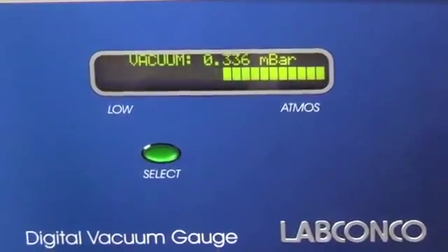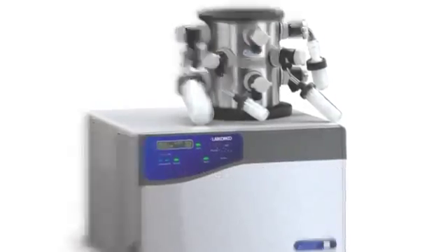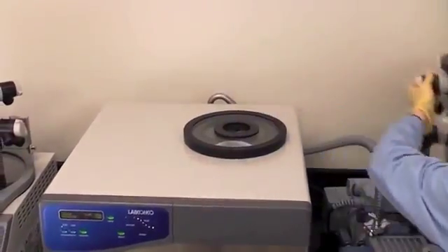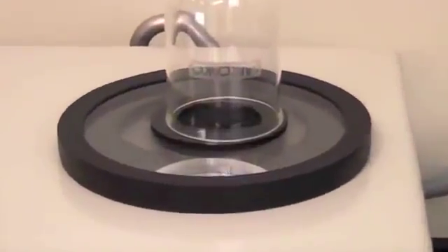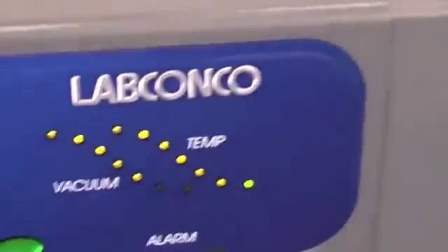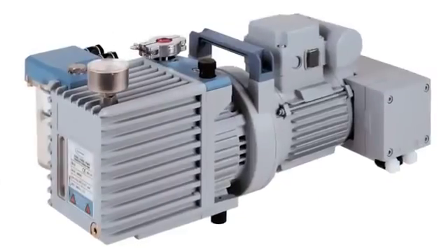If the pump does not reach vacuum, it may need to be replaced or rebuilt. If you are still having vacuum issues, check the system components and collection chamber. Remove the drying chamber or manifold, leave the gasket on, and turn a large freeze-dry flask upside down to cover the connection port. Start the freeze-dryer and observe the vacuum indication. If the vacuum indication is good, then the problem is in the drying chamber.